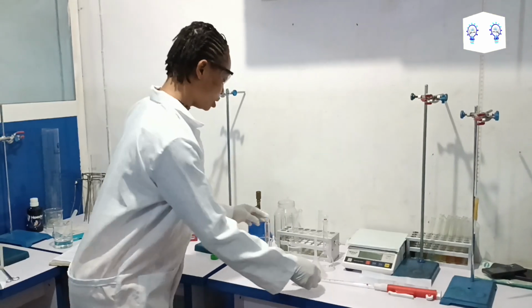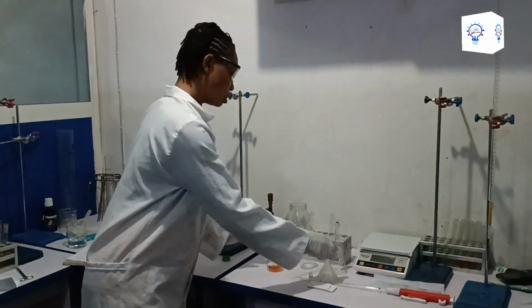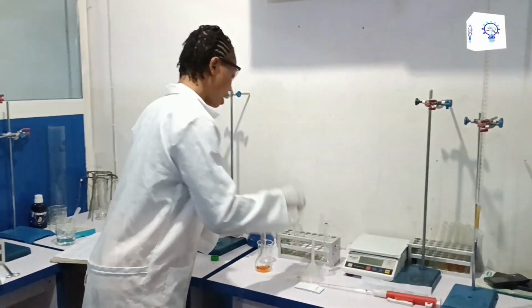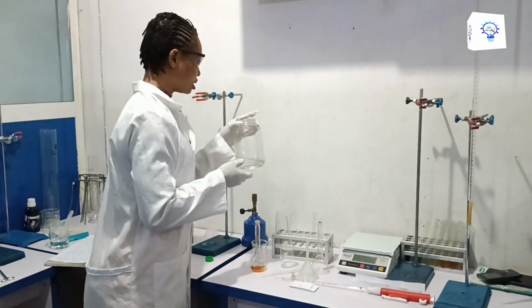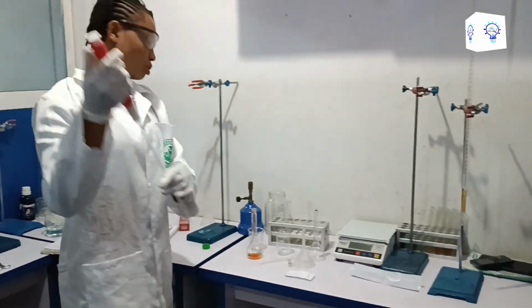This one I've already placed into the volumetric flask. This is the funnel. This is the Pasteur pipette, the beaker, the test tube wrap, and the test tube. This is the beaker jar, there's water inside. And this is the pipette and the pipette holder.